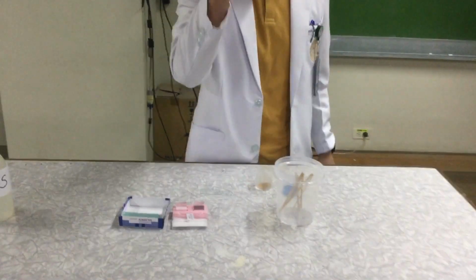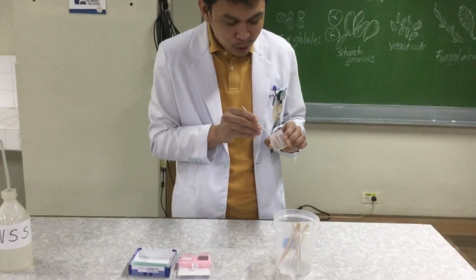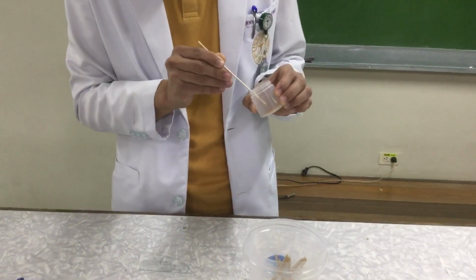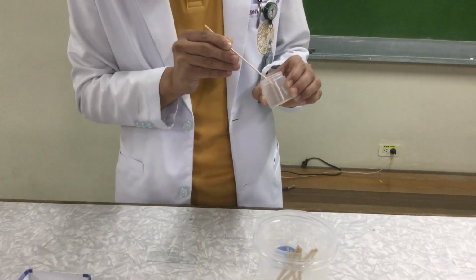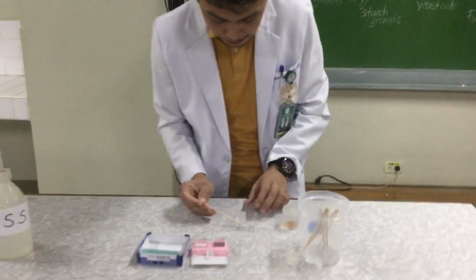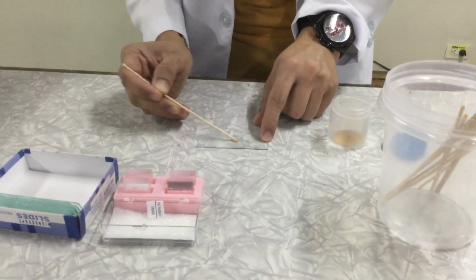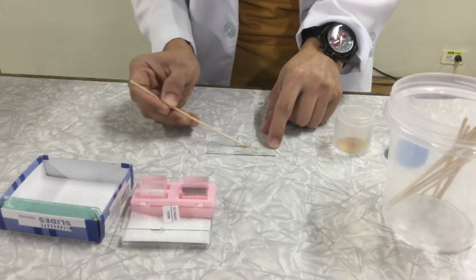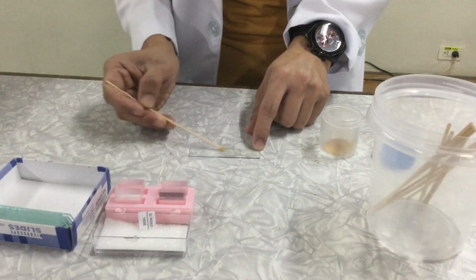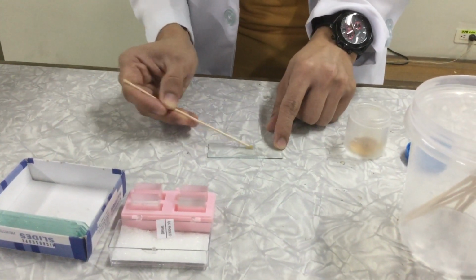And then, using the applicator stick, not your hands, get a sample of the stool. If this is mucoid, it is advisable to get the mucoid part, and take note, if this is bloody, get from there too. So, get a minute amount, make a homogeneous mixture. When you say homogeneous, it means even. Not too thick, not too light. There you are, that's fine.